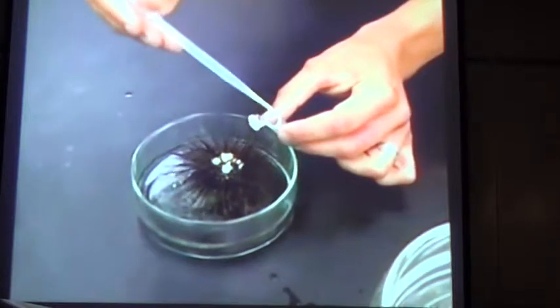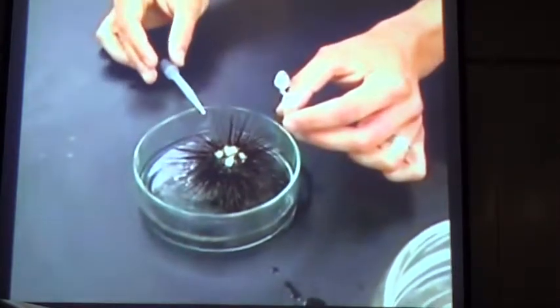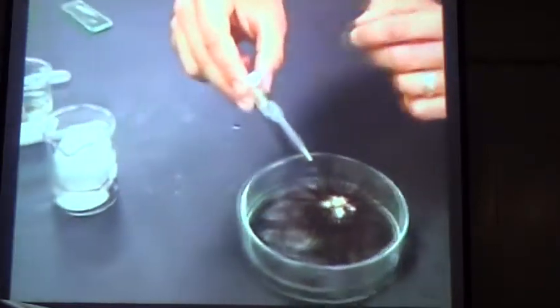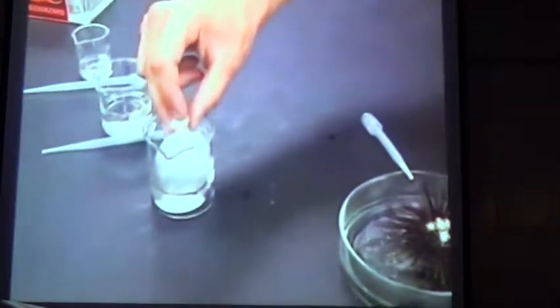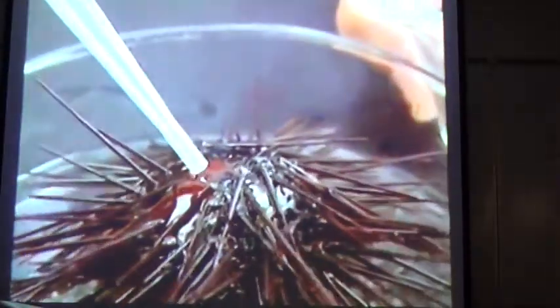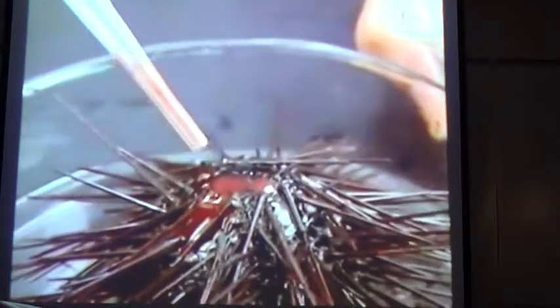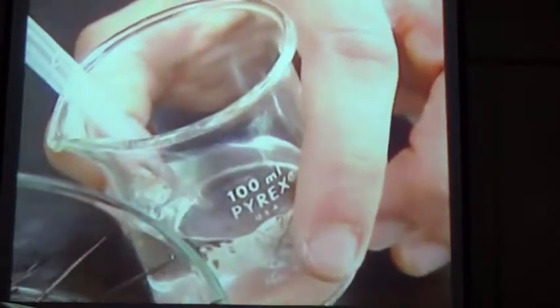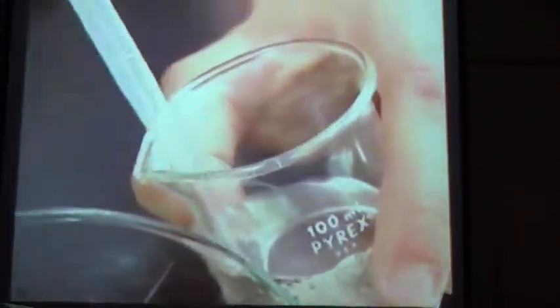When finished, place the pipette in biohazardous waste. Keeping the sperm on ice will slow down metabolic activities and keep the sperm in good condition for the upcoming fertilization process. If a reddish fluid is released, then you will be dealing with eggs. Collect the fluid with a pipette and place it in a 100 milliliter beaker containing some seawater. When finished, place the pipette in biohazardous waste.